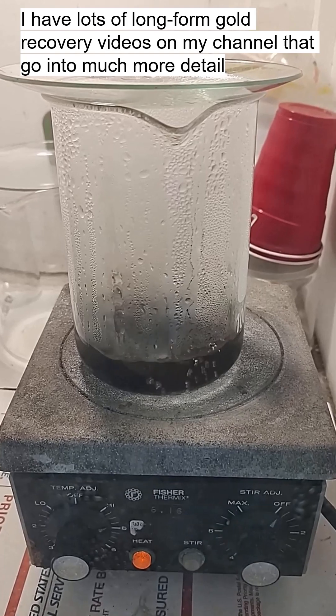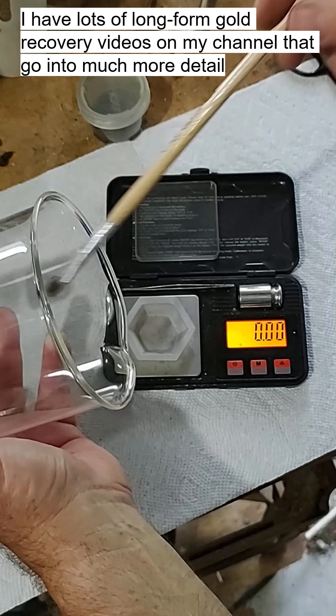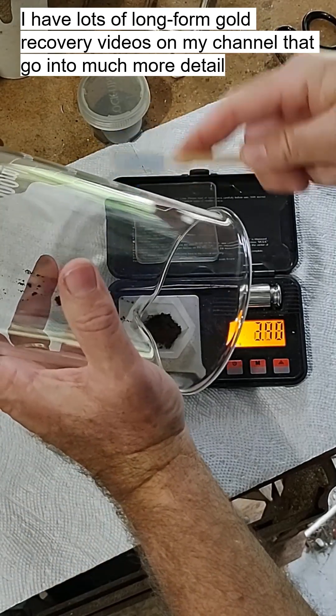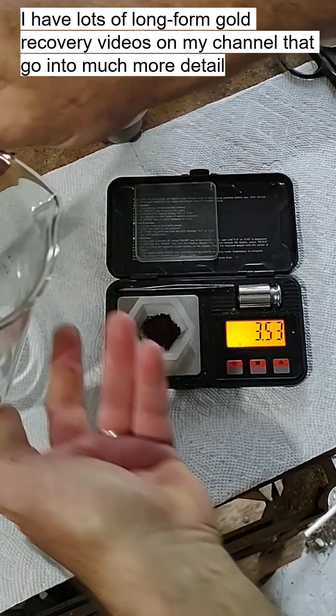Giving the gold powder some cleanup rinses in distilled water, then drying out the clean gold powder. Let's see how much gold we got — a little over three and a half grams.